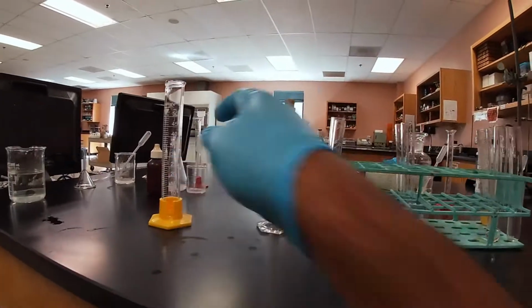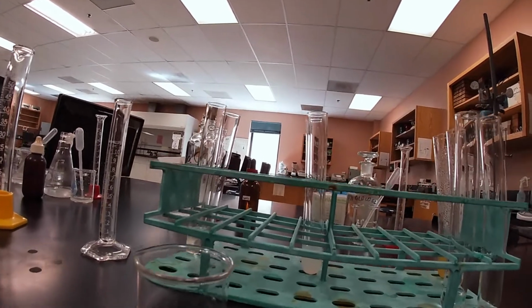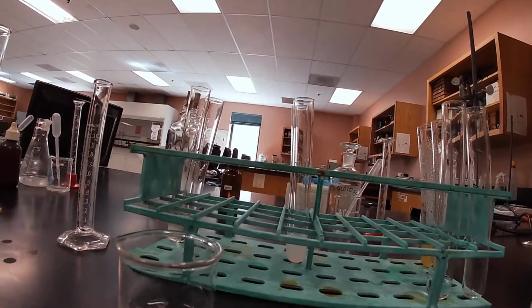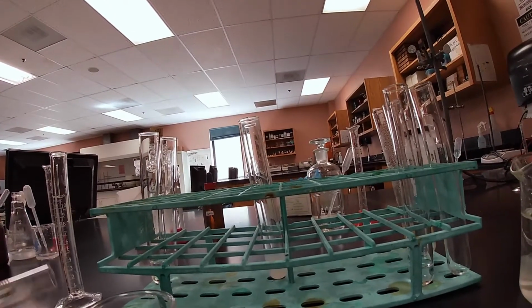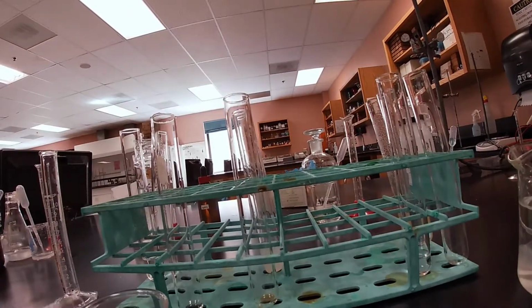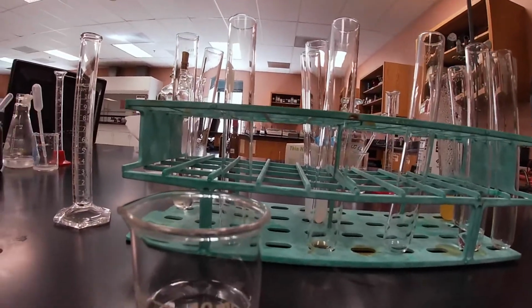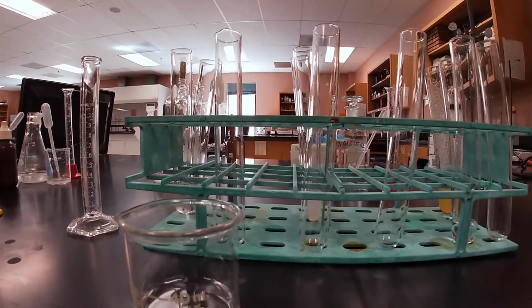And then what we're gonna do is get 3 test tubes. And based on those 3 test tubes, we're gonna determine again these tests that we talked about. So I'm gonna get 3 test tubes, and go ahead and get a proper handle. We're gonna do our 3 tests. We're gonna do our iodine test, also our silver nitrate test, and then we're gonna do our Benedict's test.